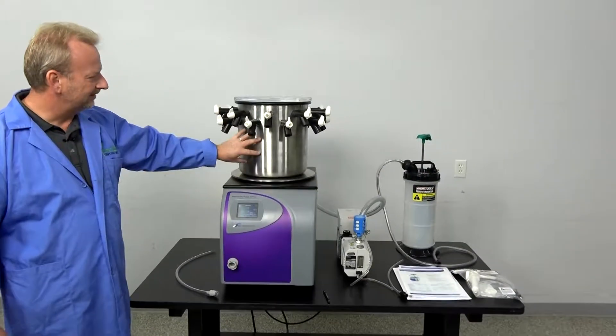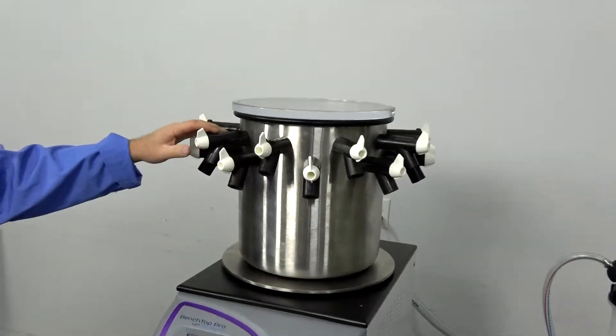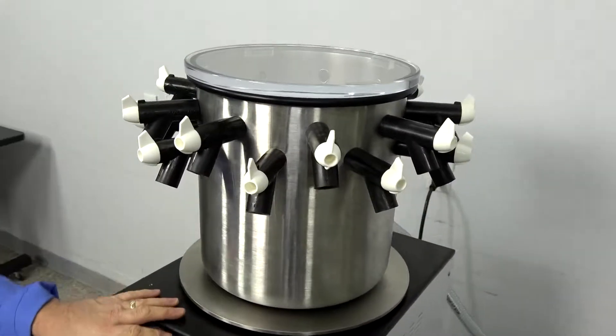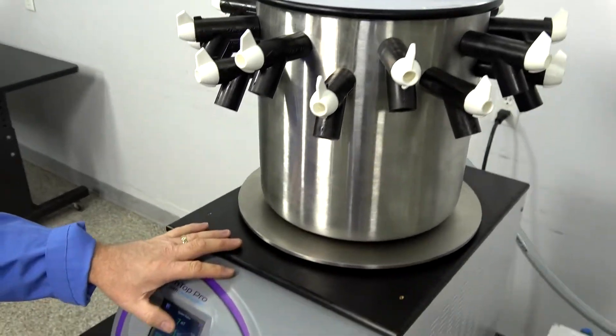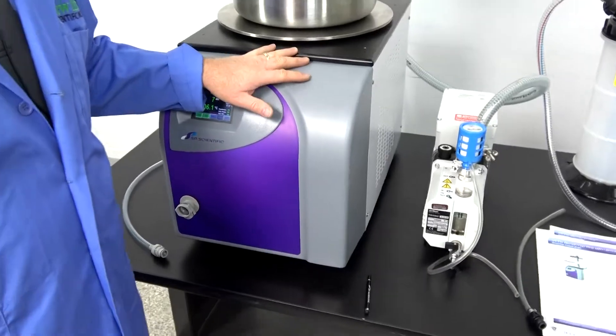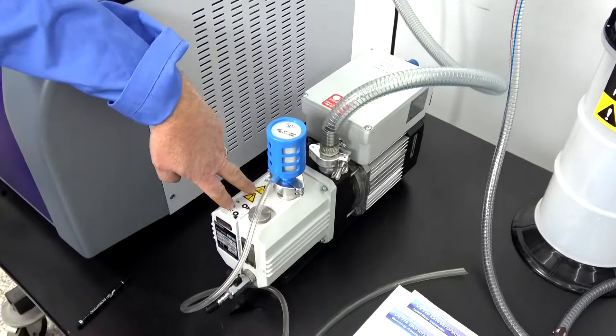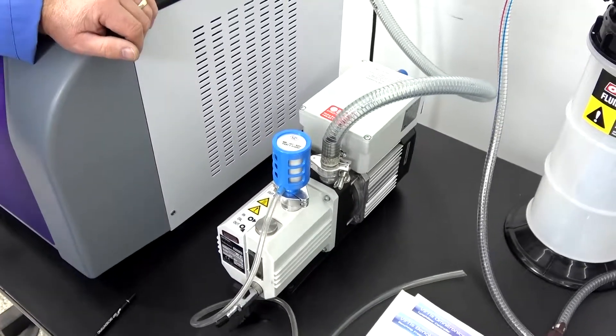We do have the 8 liter with all the ports and all the valves included. It does have the touchscreen where you can run your controls, which we'll get to, and it includes the TriVac vacuum pump — and as you can see it is working very well.